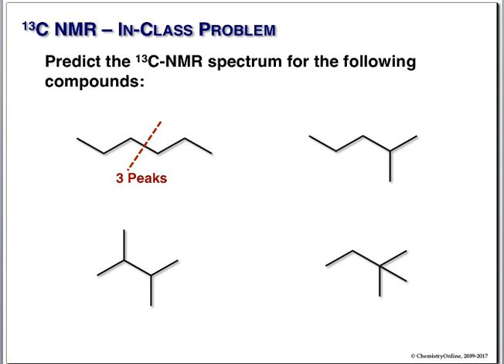Now let's look at each of our carbons and just try to guess more or less what the shifts might be. The terminal methyl, that's going to be pretty simple, isn't it? That's going to be 20, maybe a touch less. We go in here to our secondary. That's going to move up a bit, maybe 30-ish or so. This is also a secondary, but it's getting in here in the middle of the molecule. It's a little crowded. So that's going to be moved up a little bit more. So that's our anticipation.